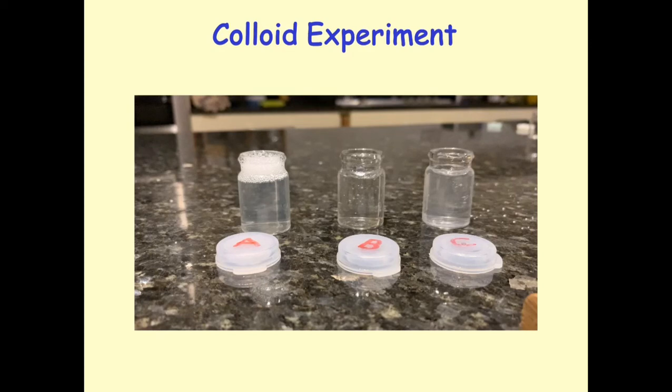And I'm going to do that with you at the summary lecture next week. So we're going to try to work out which of these samples is the milk solution, which is the sugar solution, and which is the washing up liquid solution.